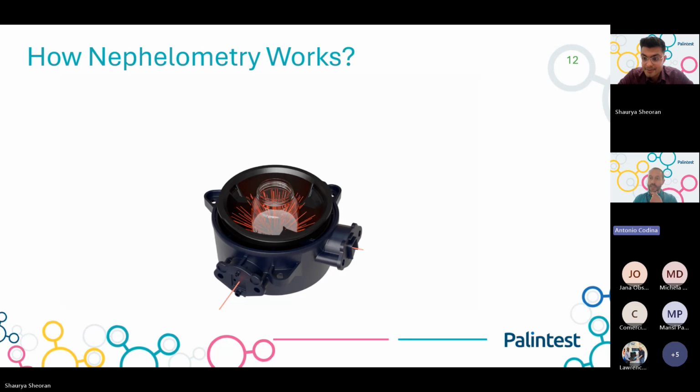Now we have some comments from Matt Ramsing, just saying that the lower range is very interesting to them. Yeah, it works very well on that range of 0.01 to 0.5. And another one asking if the instructions will be in Italian already active on the tool. Do you know that, Saria?